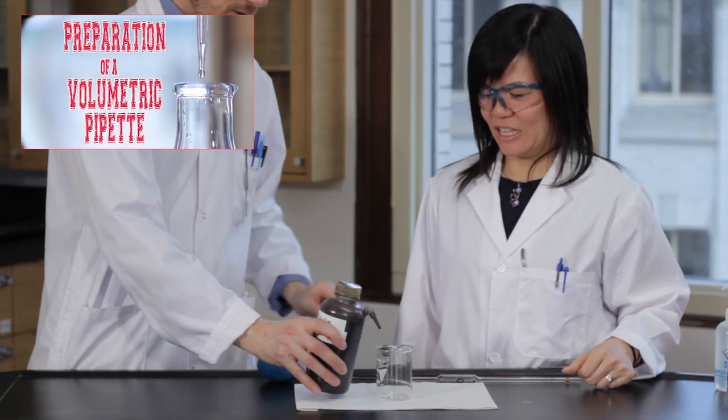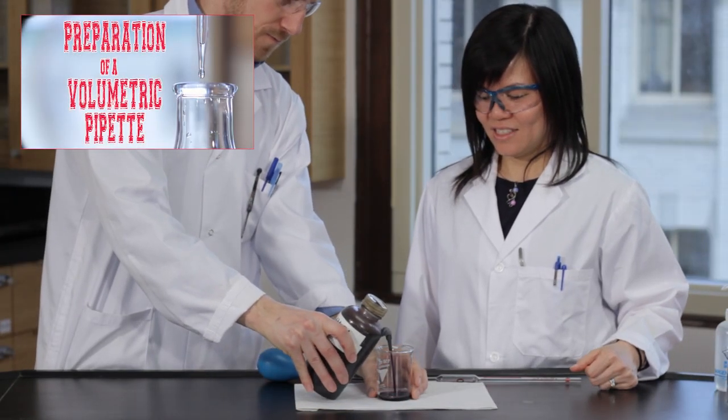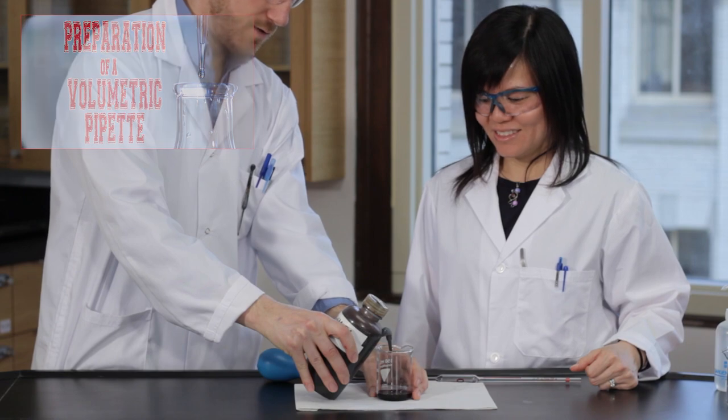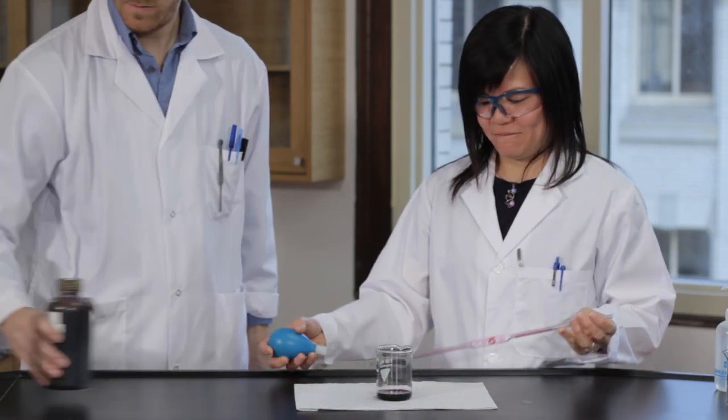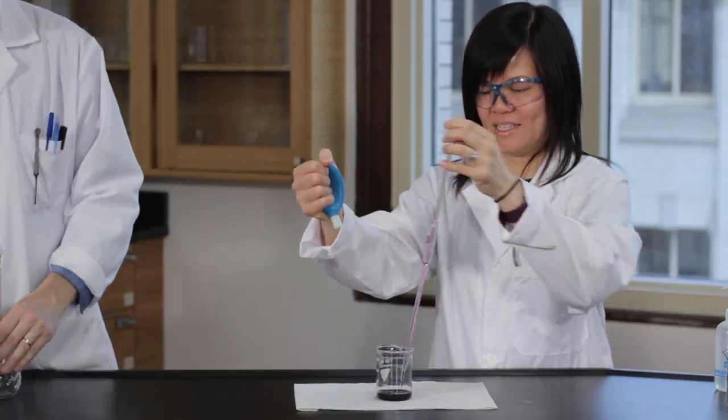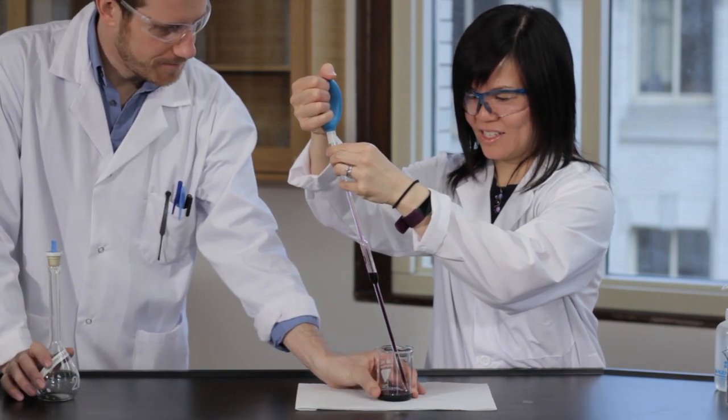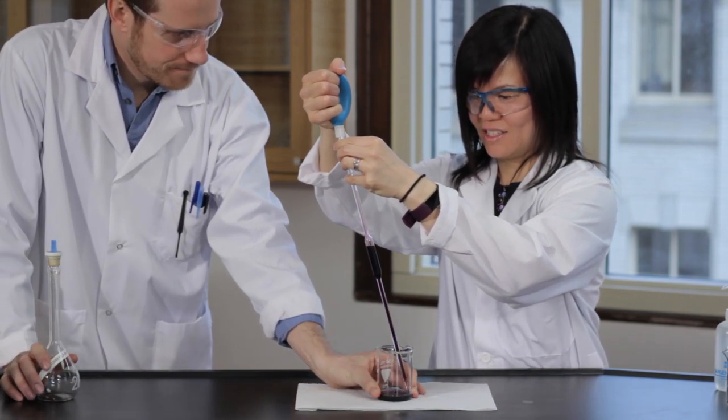Prepare a 10 mL volumetric pipette as demonstrated in another video. Measure 10 mL of potassium permanganate using the potassium permanganate stock solution and transfer it into a clean, dry, 250 mL volumetric flask.